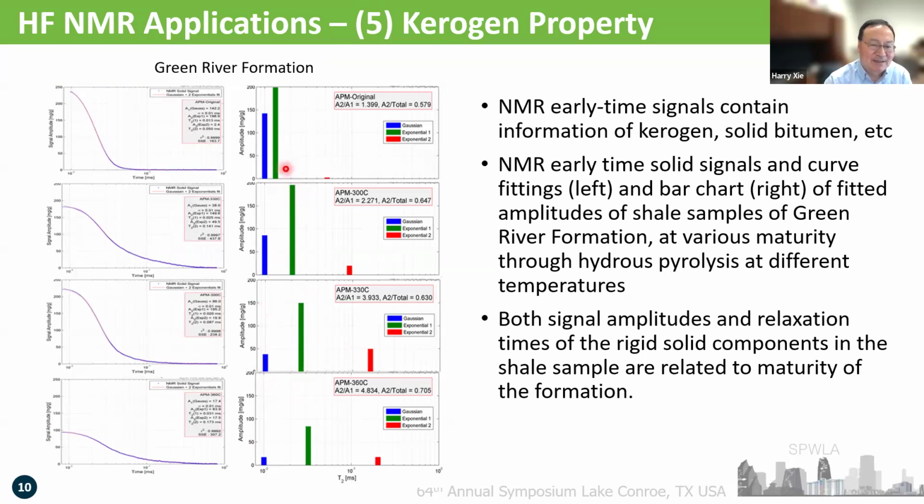And the other part is produced, maybe kerogen-like, bitumen-like organic matter. So that's what we give you. And the red part could be the residual oil produced, and also some water not dried off. That's why you see a little bit of residual there. So that gives you a kind of work to do for the geochemistry study.